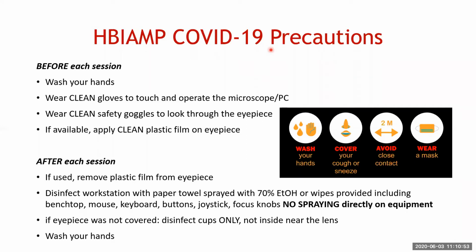And then after, you want to remove that plastic and disinfect everything. Obviously, you don't want to spray the equipment directly. No spraying of the expensive equipment, common sense. Just the stuff that you've touched. And again, wash your hands, and usual common sense applies. We've got signs reminding you of this throughout the entire lab. But if you have any questions, let us know. We want to make sure that we keep up the status quo, so that we don't have an incident and then everything has to shut down again. I'm sure you guys are sick of that. So try and follow the rules if you can, please.